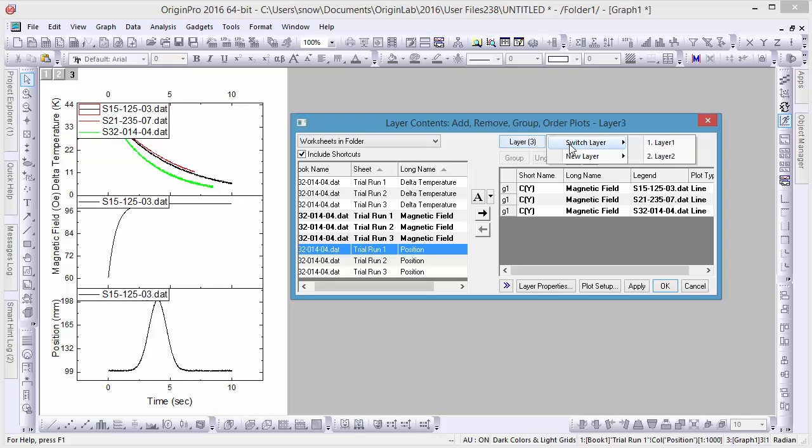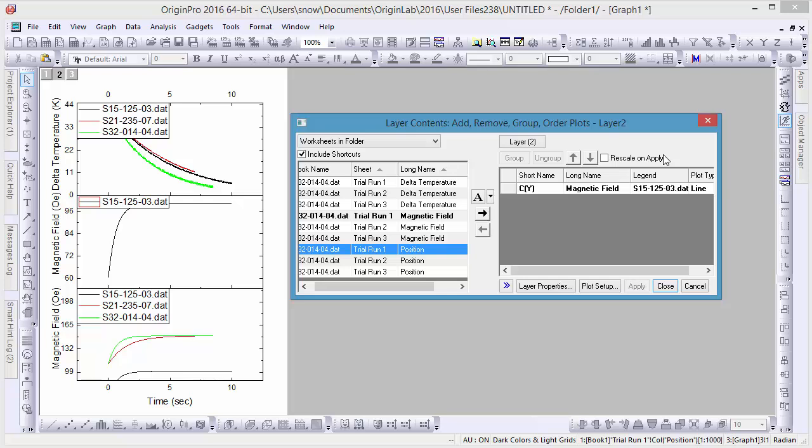Going back to the Layer menu, we'll go to Layer 2 and repeat these steps for the three series of position data and the one magnetic field plot, respectively.